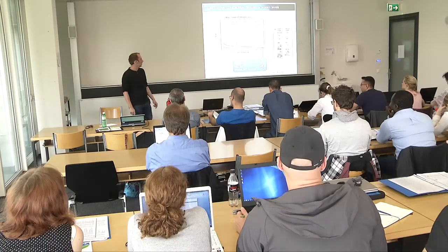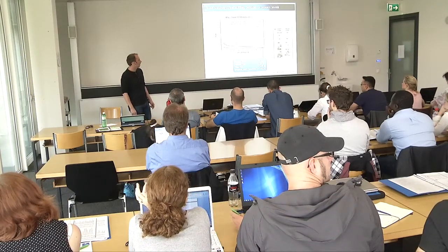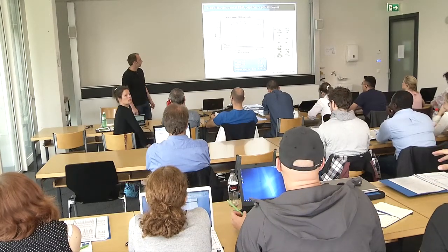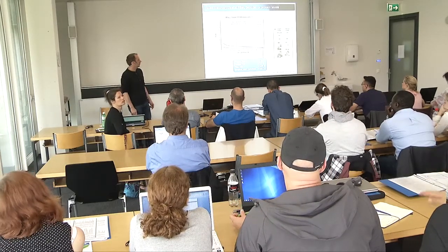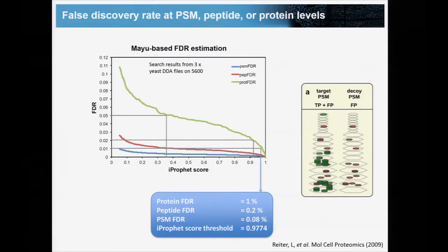And regarding the right part, what about taking only peptides where you have two spectra? Because you say your PSMs on the decoy propagate uniformly on the decoy space, and they stack up on the target. So you could go for only if I have two spectra for one peptide. Does it help? In most cases, not.